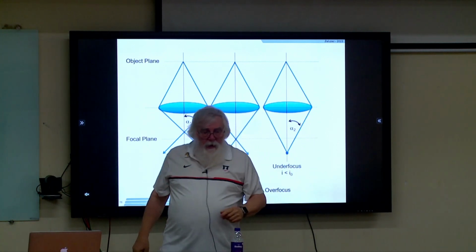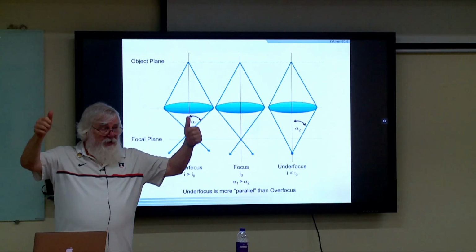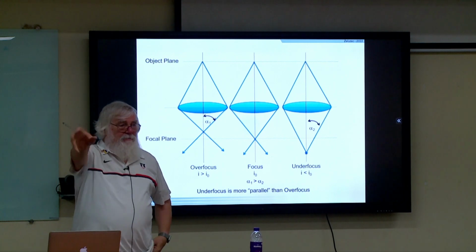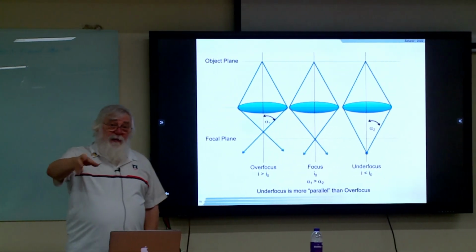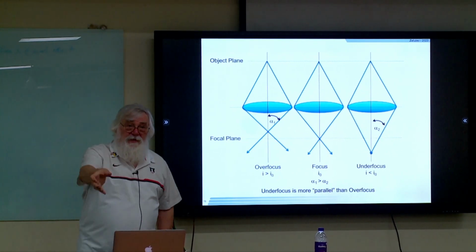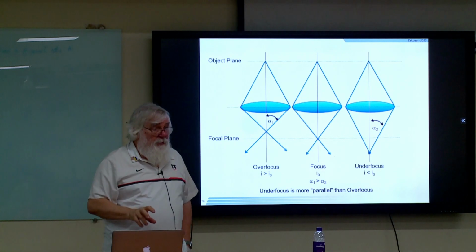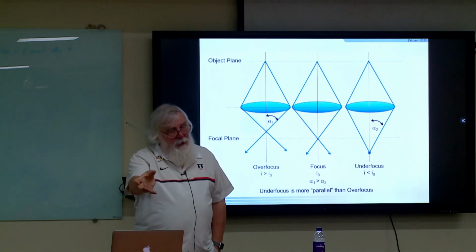The other thing in most microscopes, and this is just a rule of thumb, there's always a knob that you turn to change the lenses. In the past, that used to be a real knob that turned a resistor and made something happen. The convention has always been that when you turn the knob clockwise, you're increasing the current.